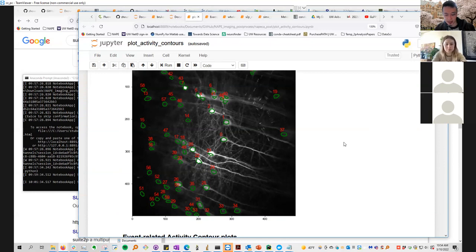So your event data. Yeah, the event data for mine is difficult, right? Because my event is a continuous measure. Yeah. So my thought right now, because we're using that cross-correlogram analysis in order to align activity and circulating glucose, I think that's the pipeline I'm going to have to get up and running. And I already have all of that code. I just need to figure out how to load essentially all the individual cells' CSV files into it. So I don't think it'll be too bad.